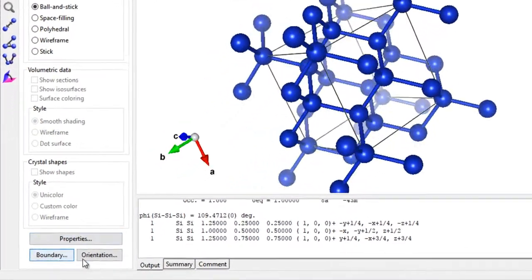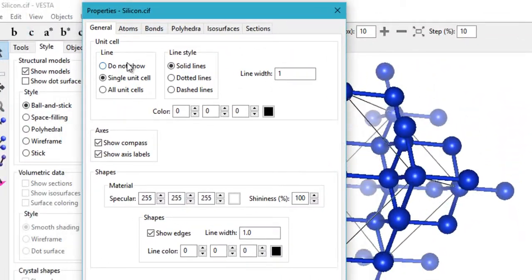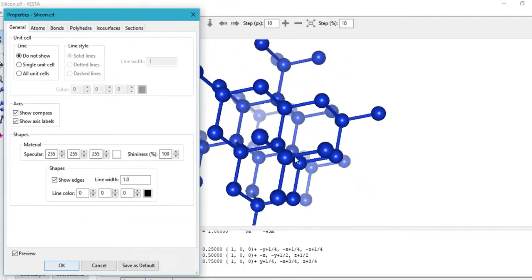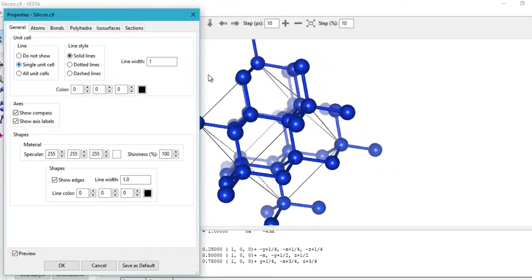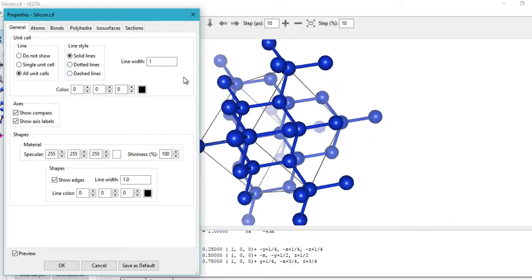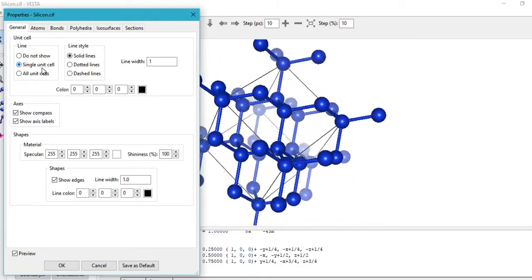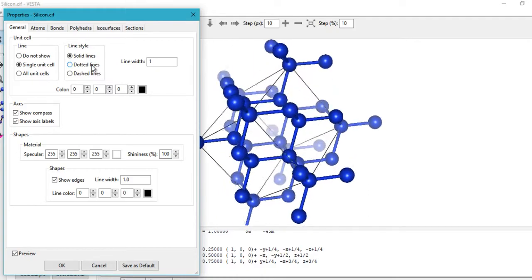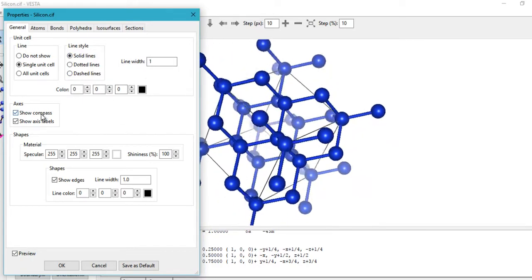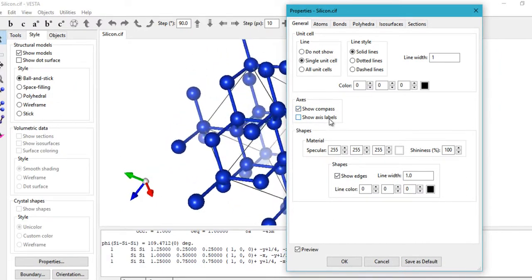Coming back to the Style tab Properties, you can control the unit cell display. You can choose to not show the unit cell, show a single unit cell, or show all unit cells — useful when you have a supercell or extended structure. You can set the line style to dotted or dashed, adjust line thickness, line color, and whether to show the compass and axis labels.